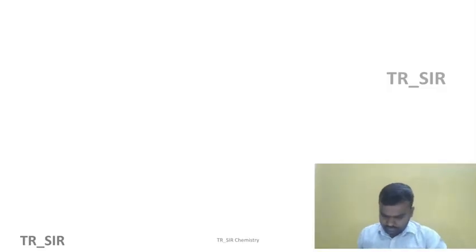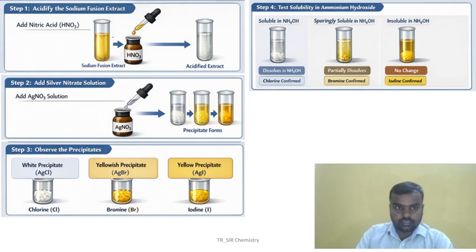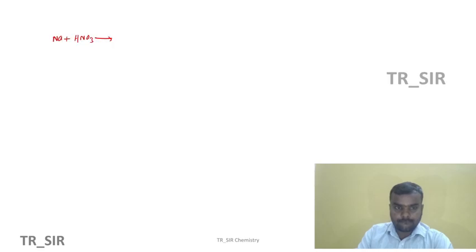So here we'll see the test. First, the sodium fusion extract is acidified with nitric acid, HNO3, and then treated with silver nitrate. We are acidifying with the nitric acid, then treating with silver nitrate.